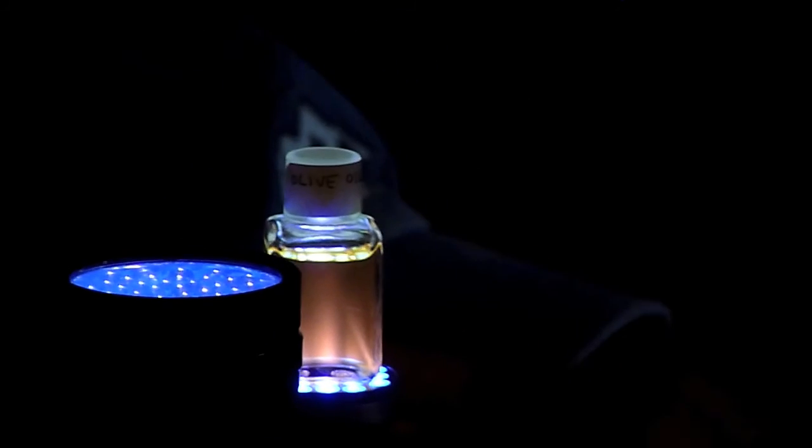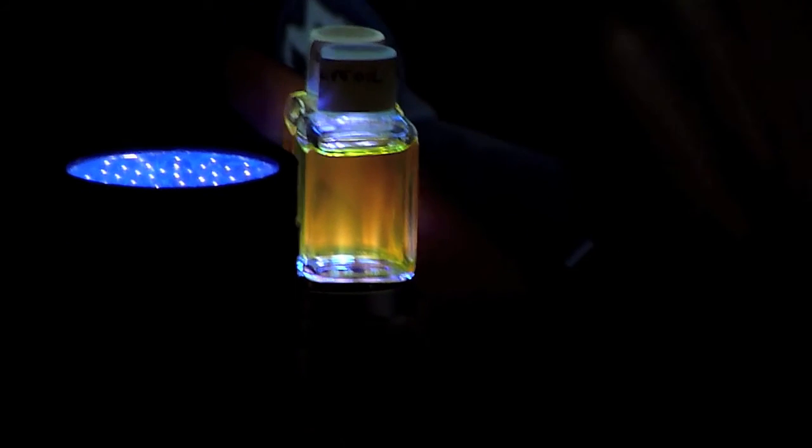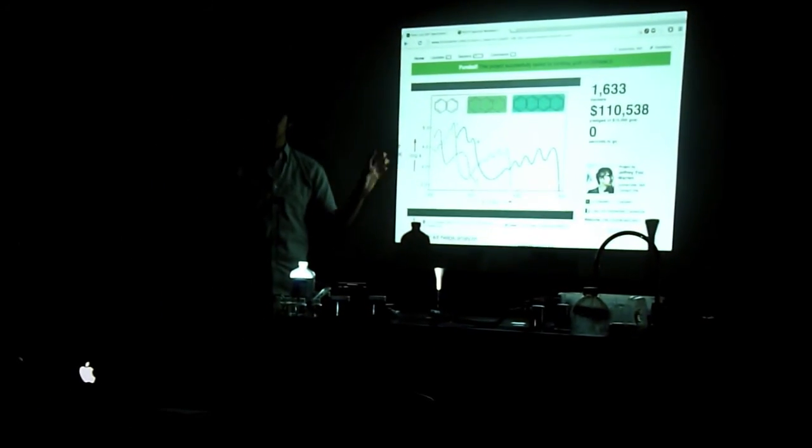This is a better UV light. So that's the extra version. The orange one. Yeah, a lot better light. And do you actually know what that orange is from? Well, the molecule. Well, in this one it's chlorophyll. Yeah. But sorry, in the BP oil it's probably not. In the BP oil, there's the bad stuff.